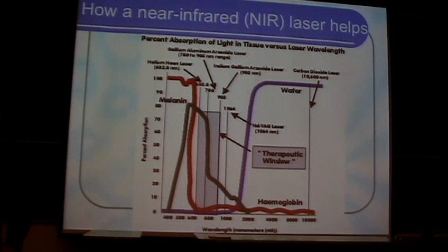You can see that this near-infrared spectral range is very useful for this excitation process, because biological specimens do not absorb or scatter light within this spectral range, and this means that the excitation light can penetrate deep into the biological samples.